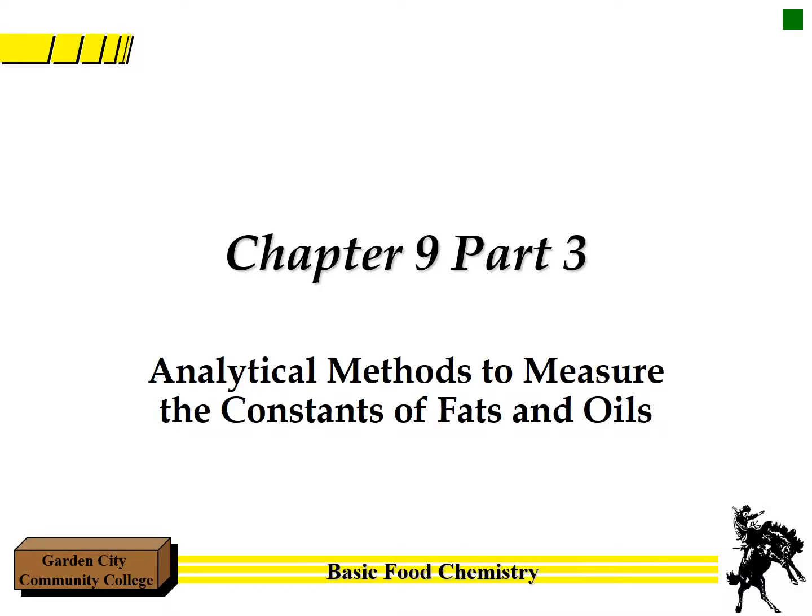Basic Food Chemistry. Here we are, Chapter 9, Part 3. We're going to talk about analytical methods to measure the constants of fats and oils. So, what do we do to actually get fats and oils out of a feed or food sample?